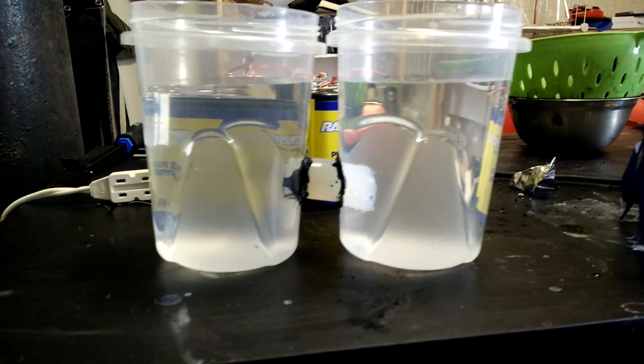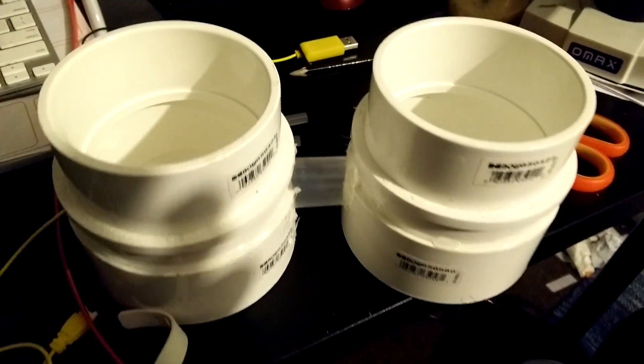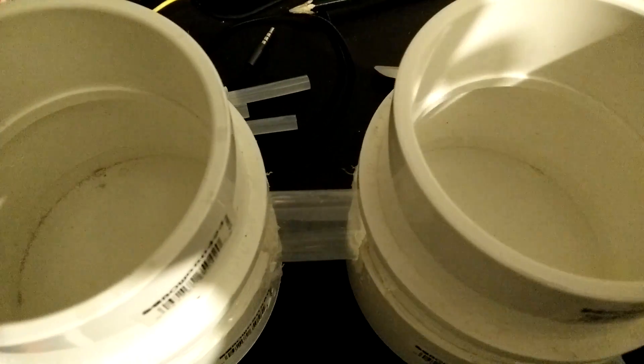A membrane cell always has a few of the same basic parts. First you need two containers to hold the different liquids. Then you need to connect the containers with a bit of large diameter tubing. This tubing will hold the membrane later.